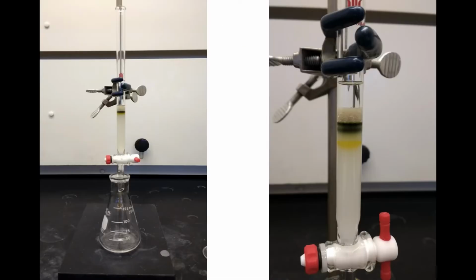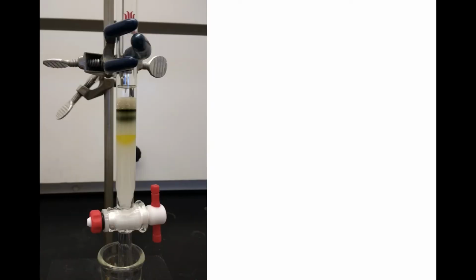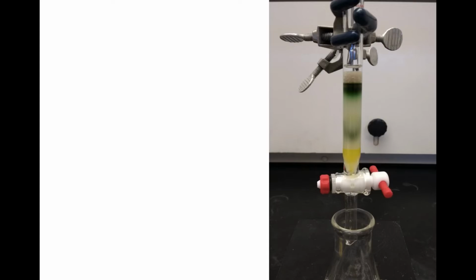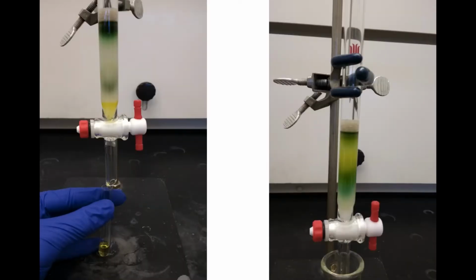In the experiment, we will see the first yellow band is separated from the rest of the pigments, when the pigments are eluted using a lower polarity solvent. The carotenes are separated and isolated from the other pigments. To separate the chlorophylls, a slightly more polar solvent is used, a 50-50 mixture of hexanes and acetone.